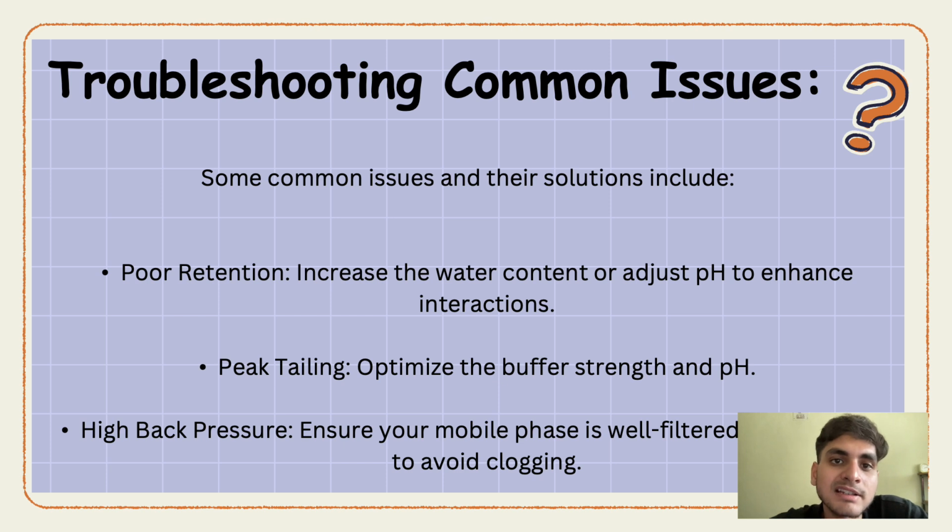And there are some common issues with HILIC, and their solutions are included here. Poor retention. For troubleshooting this problem of poor retention, increasing the water content or adjusting pH to enhance interaction helps.